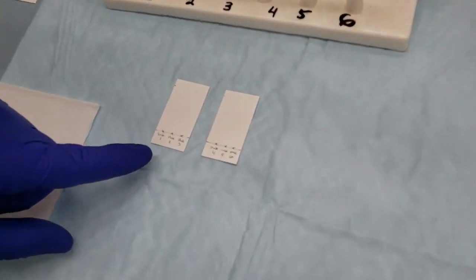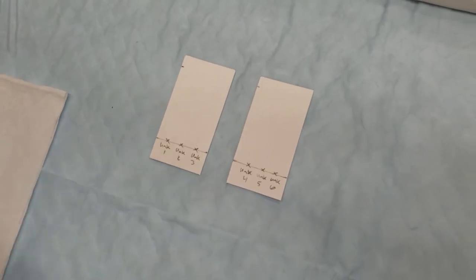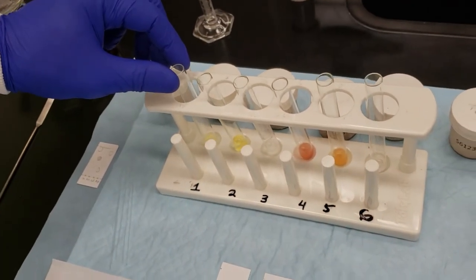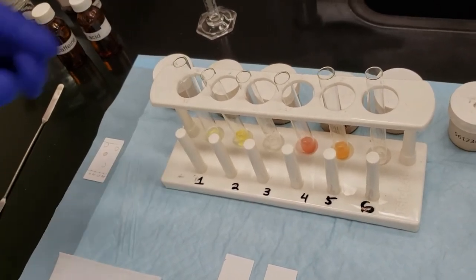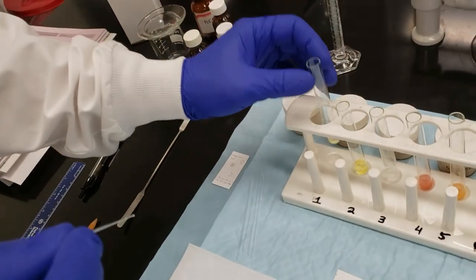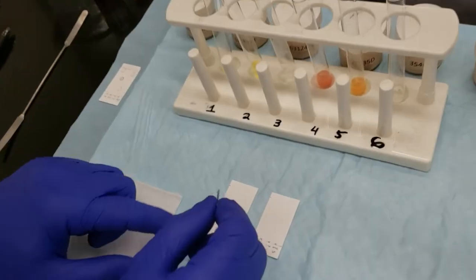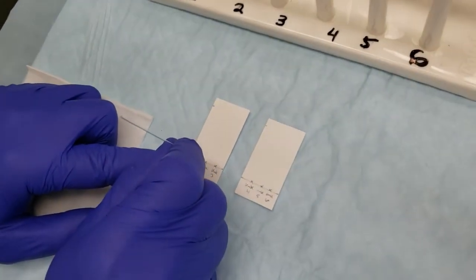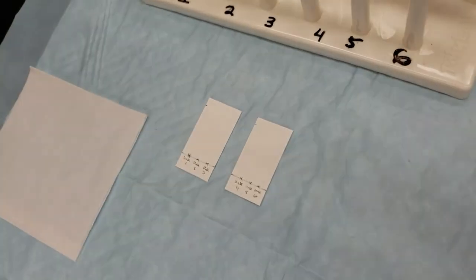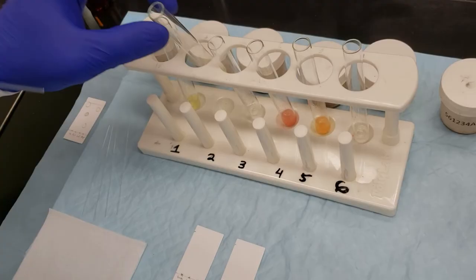All right, so now we're going to set up our unknown plates, 1 through 6, 3 on each individual plate. We've mixed up our solutions, of course. We did that in the very beginning of the video. I'm going to go ahead and spot these on the plate. Now, these are fairly concentrated solutions, so I'm just going to do a single tap per lane, and that's all we're going to need. Then I'll move to a new capillary, go to the second tube.